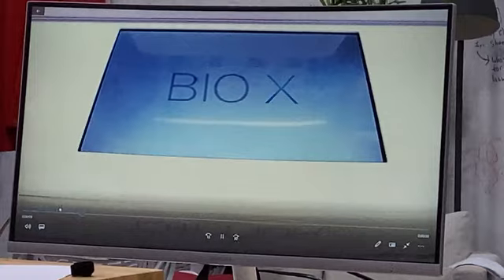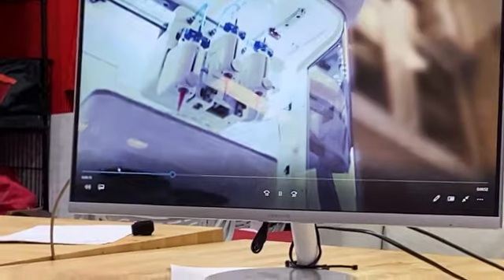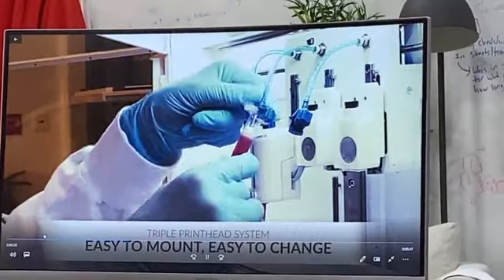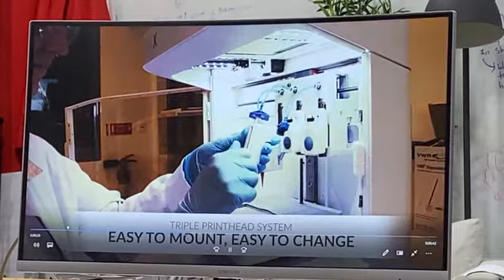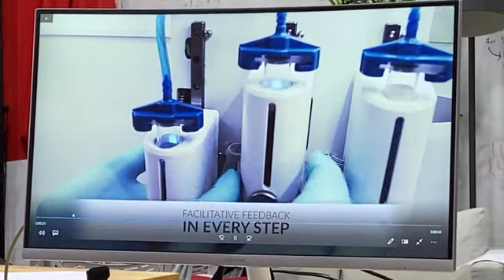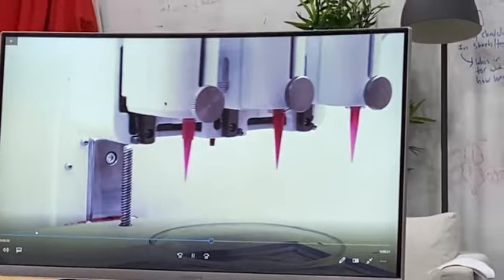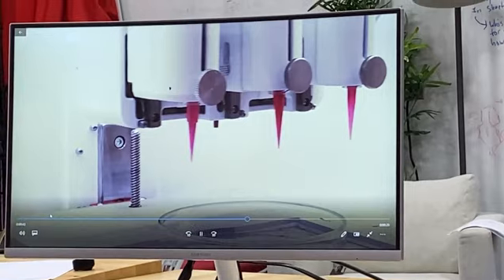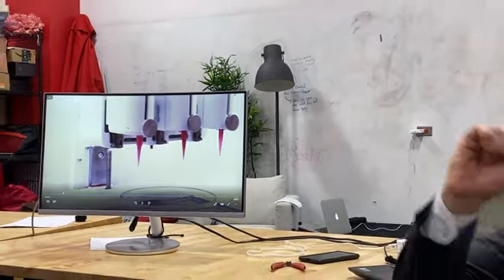Chris, you were mentioning this morning, though, it's not just the print time, because once it's printed, it then has to undergo the biogenesis of the cells, and they have to grow, and that could take weeks to a month for the function to develop. Yeah. So you have two ways to print. For example, if you print a vascular network, you can print with the biomaterials adapted to those kind of cells and wait just for the migration of those cells to grow through that biomaterial. Or you can seed the biomaterials with the cells and accelerate the process.